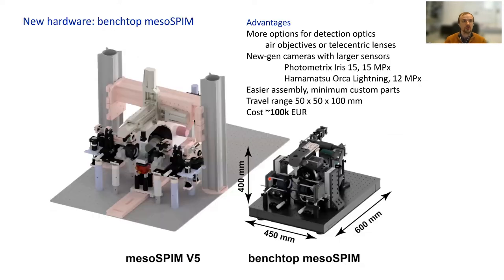Besides improvement on software, we also have a new hardware project called Benchtop mesoSPIM. It is shown here in CAD model compared to the previous version. It is a much smaller footprint, lower cost, uses air objectives or telecentric lenses, and larger sensor cameras, for example Photometrics Iris 15. It is much easier to assemble with fewer custom parts, and its cost is almost half of the previous version.